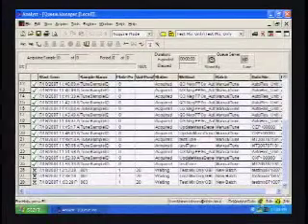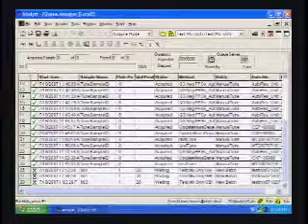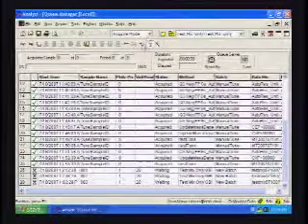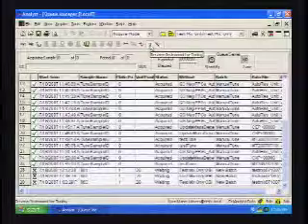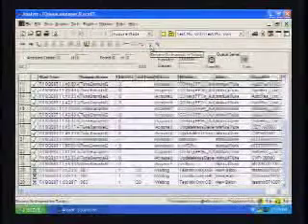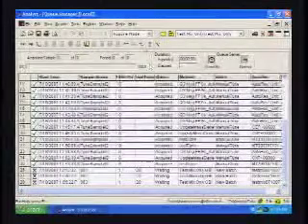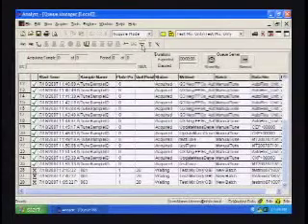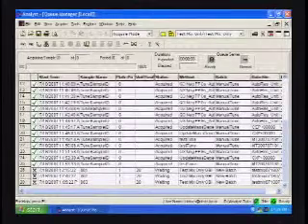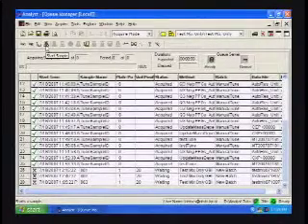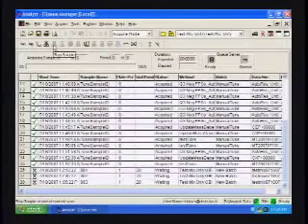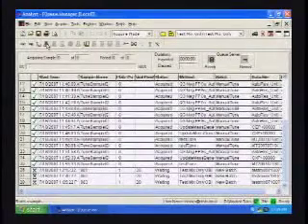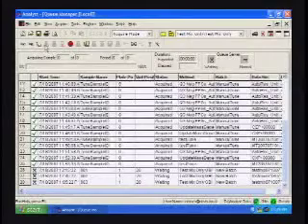Which number one, we want to not reserve the instrument for tuning anymore. So I click on that, and then we want to put it in the ready mode. And we can hear the gas start and a click from the instrument. And now the start sample is no longer in gray, so it's available for starting the run. So if we click on that.